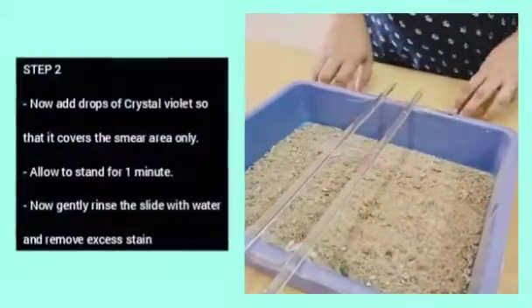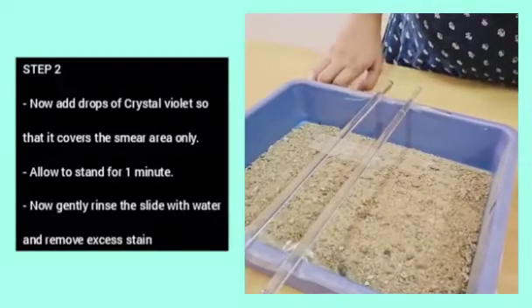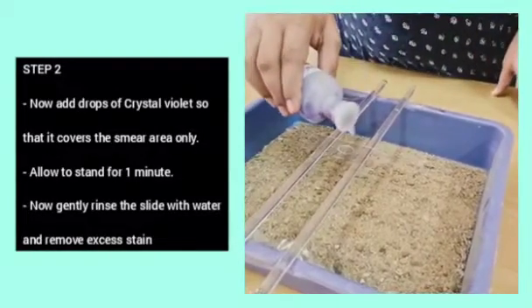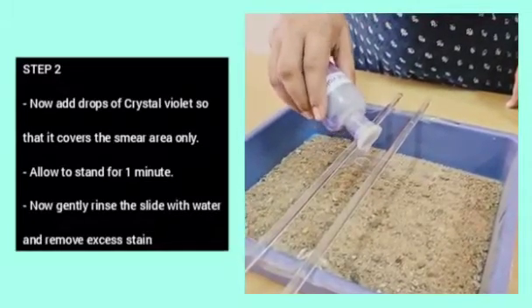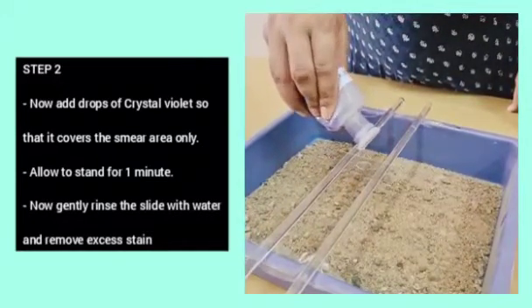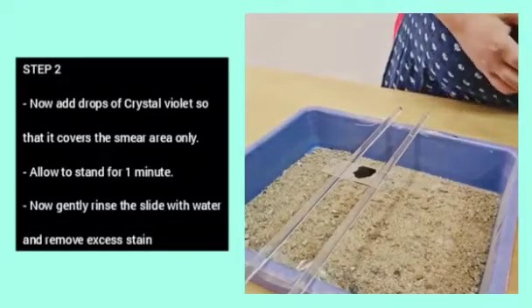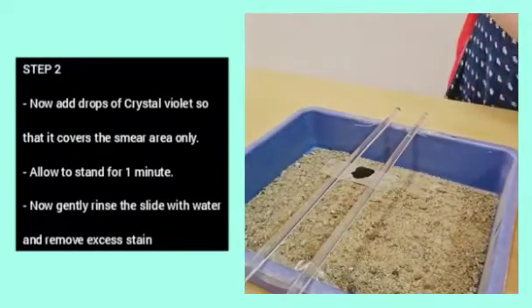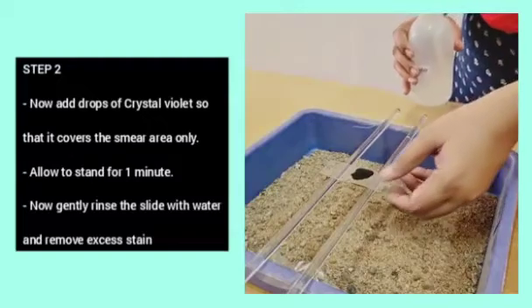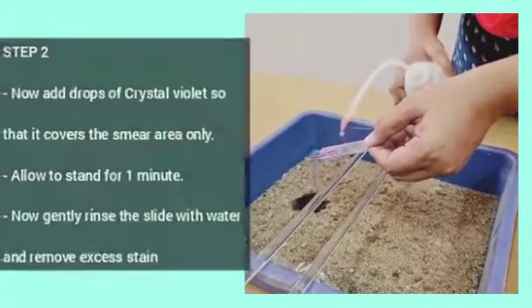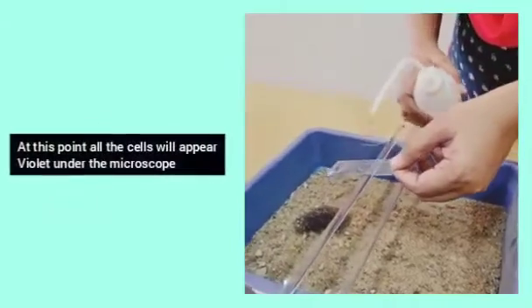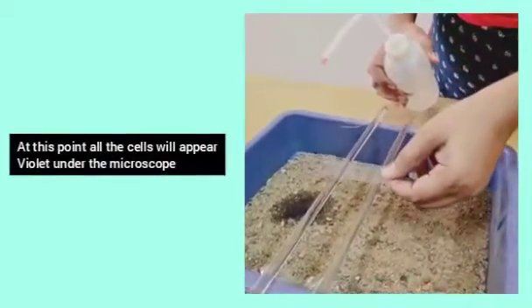Step 2. Now, add drops of crystal violet so that it covers the smear area only. Allow it to stand for 1 minute. Gently rinse the slide with water and remove the excess stain. At this point, all the cells will appear violet under the microscope.